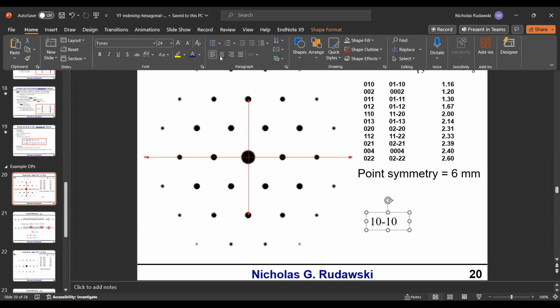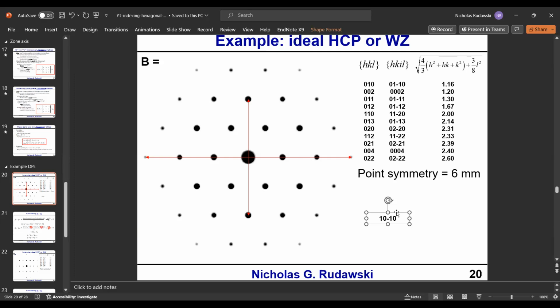Let me clean this up a little. Arial. Let's make this way smaller. I think I had to make this like, yeah, we can make it bigger on this because the spots are spaced out a little more. On some of the other ones, we're going to have to be a little bit more conservative. All right, let's do 14. Okay. All right, that's good. Come on, Control B. There we go.